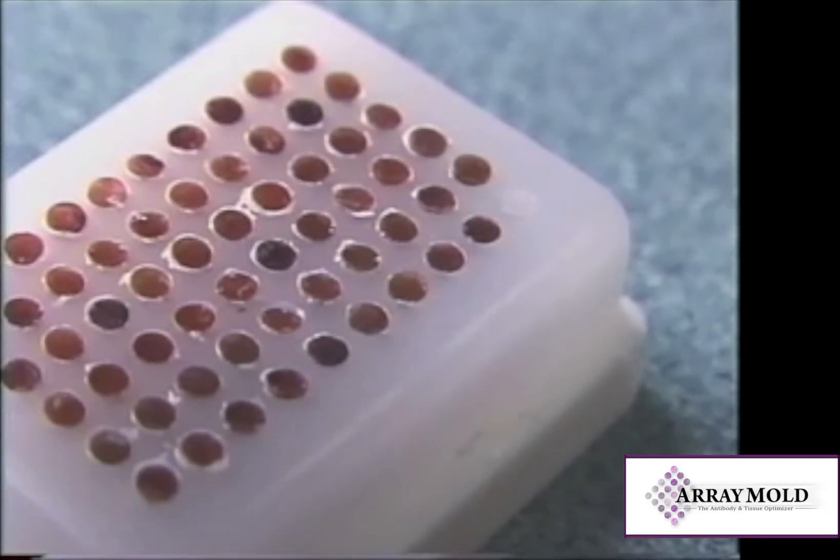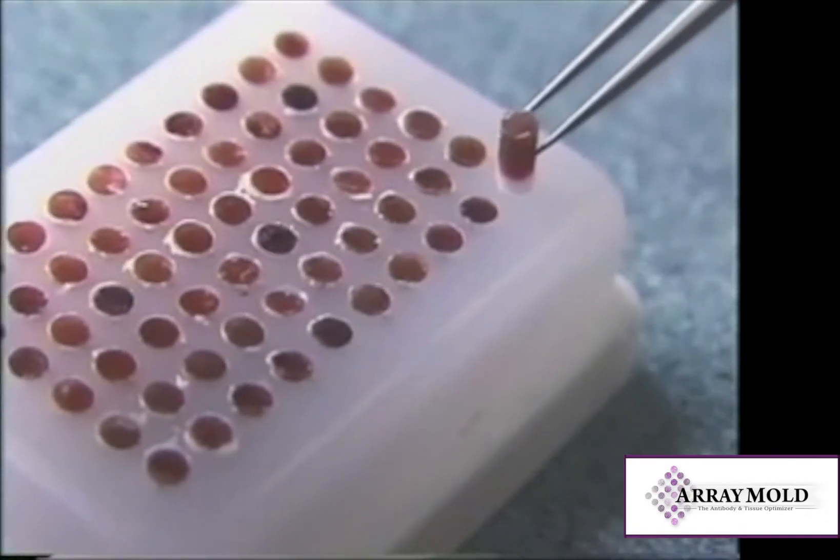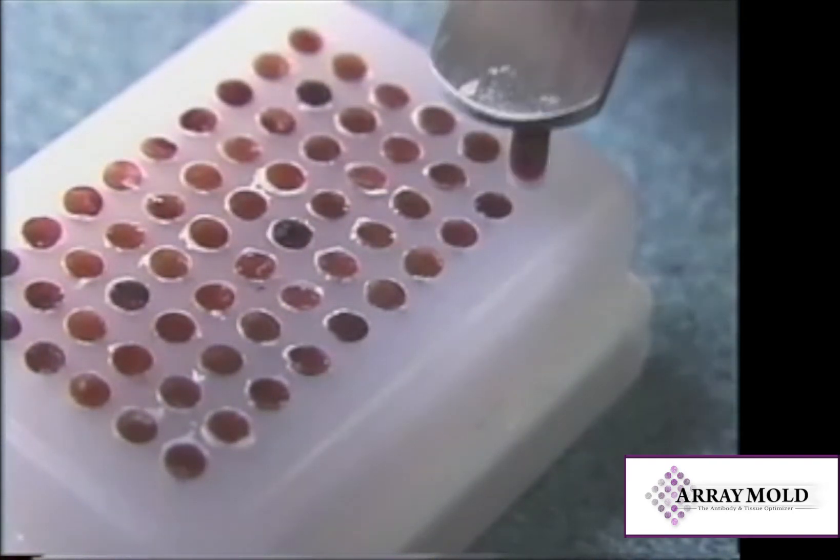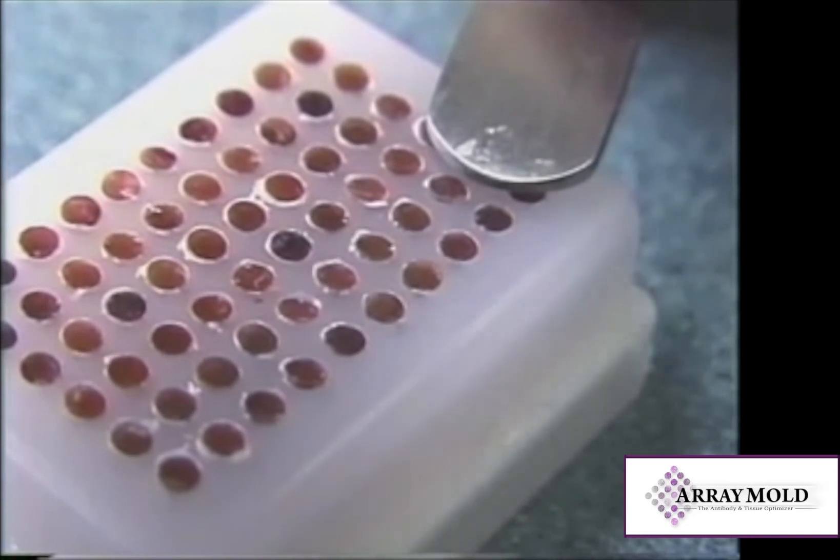If the core comes out of the needle, use forceps to insert the specimen. Flip the forceps over and use the flat end to push the core into the array block.